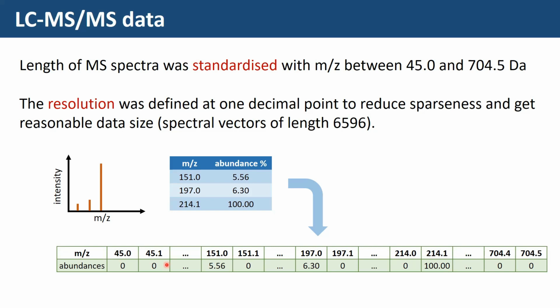And then we decided to get a resolution for the data set at 1 decimal point, because this was our first preliminary attempt at modeling this data.